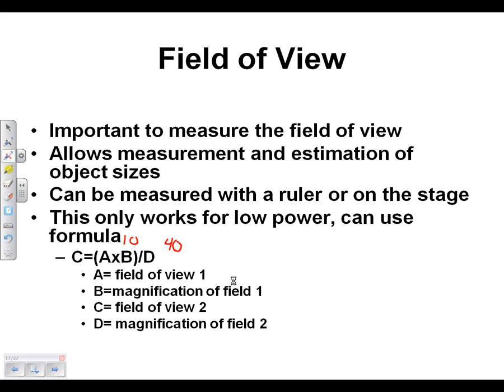So keep in mind that the way we're going to use it this week, though, is field of view is just going to be what you can see under the microscope at one time, and that will be important when we talk about counting the yeast that you're going to count for the budding experiment.